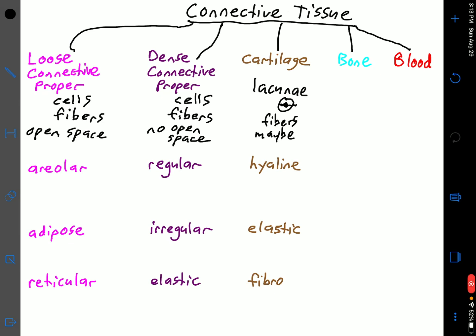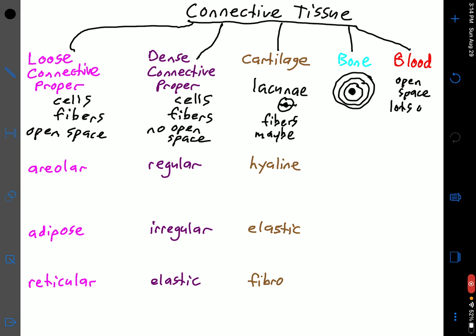Bone is pretty easy to identify. If you see a central canal with rings going around it, that's bone — nice and easy. Blood is another easy connective tissue. If you see a bunch of open space — that's blood plasma — with lots of different cells that look different from each other, that's blood.